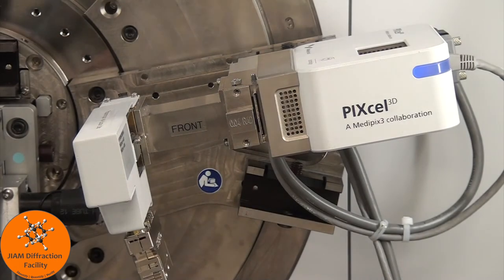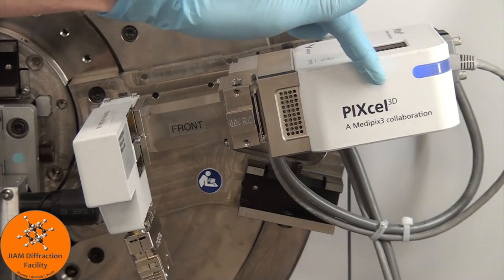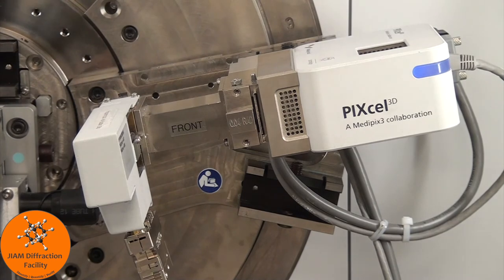And finally, we have the detector shown here. It's a pixel detector, and it is able to collect over 3.3 degrees of 2 theta all at once in a single position. So it allows for much quicker data collection with less noise. And that comprises all of the optics and the different parts of the standard powder diffraction setup.